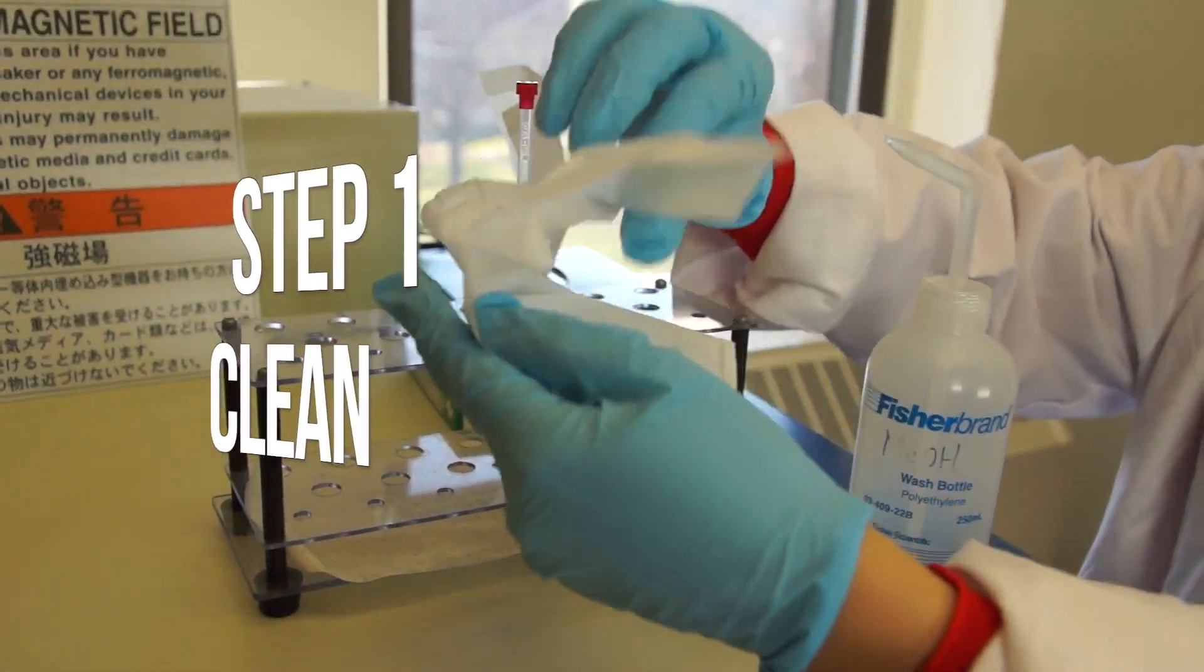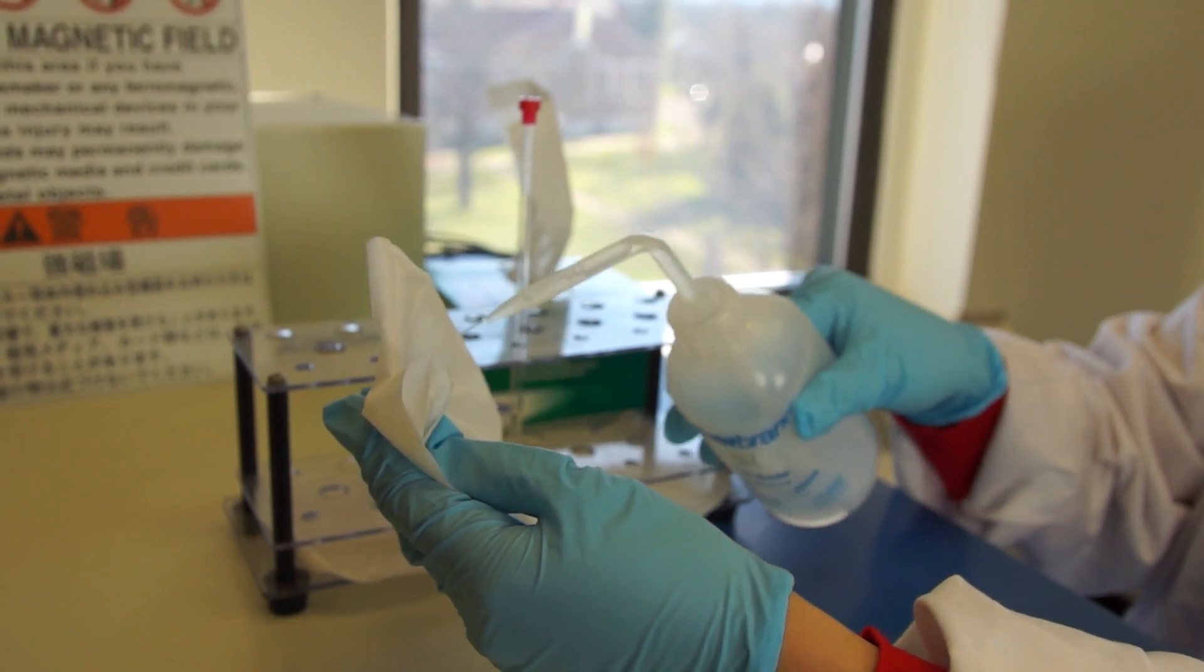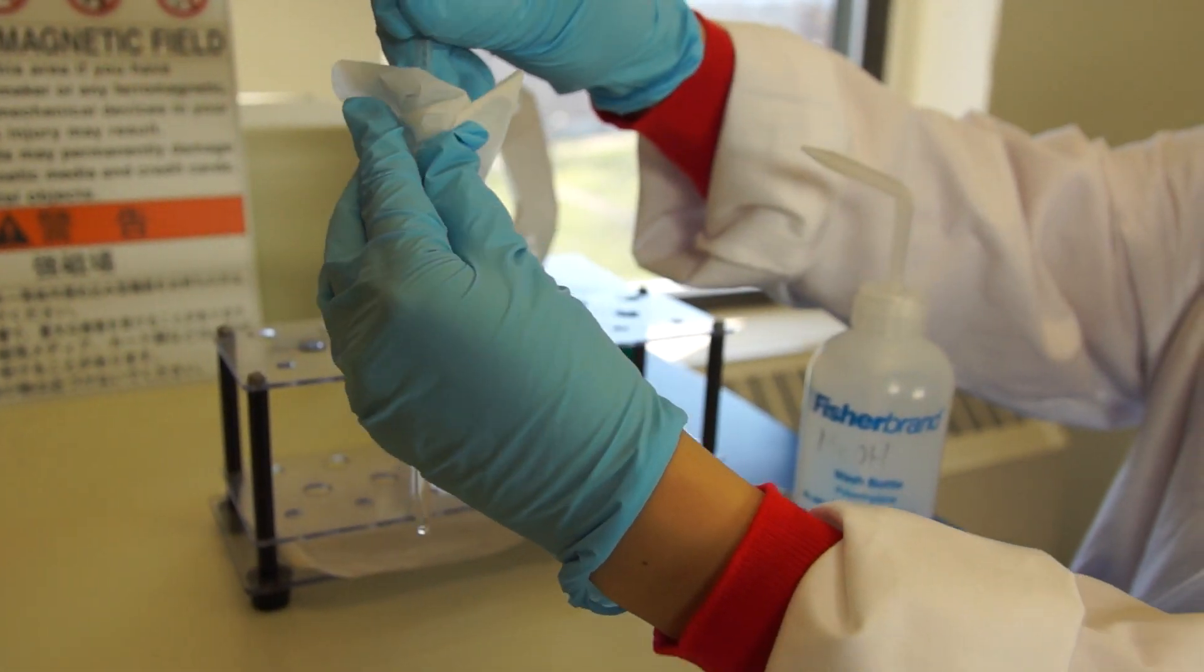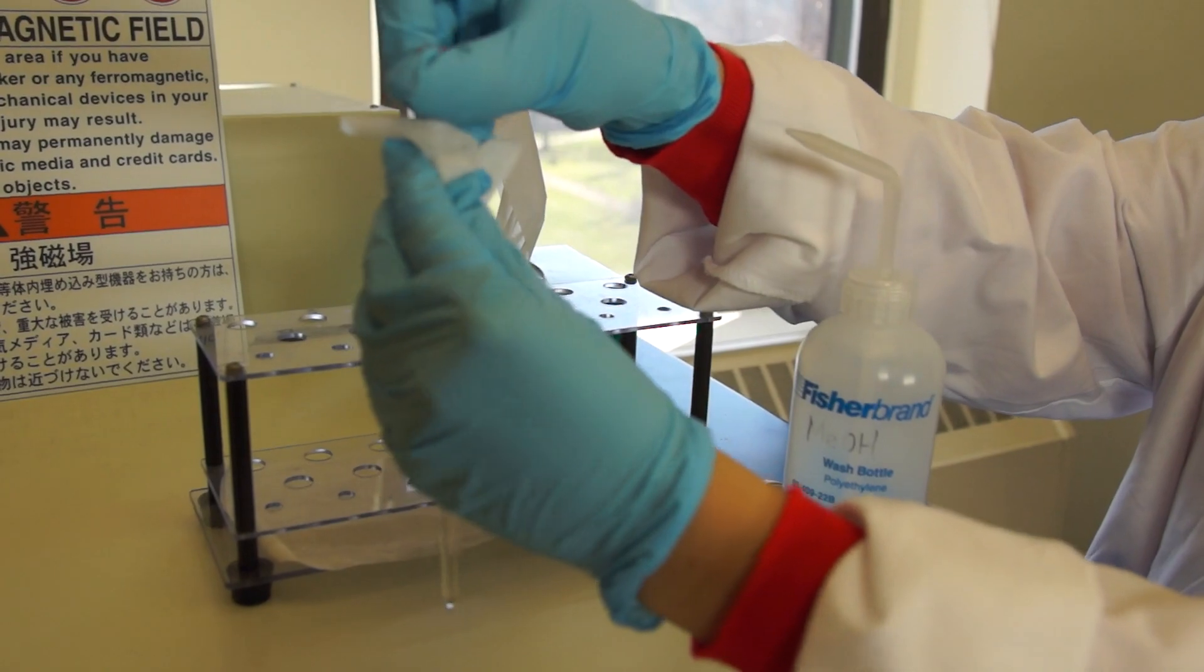The first step is to clean your NMR sample. Spray some methanol onto a kim wipe, just a couple drops, and then wipe the NMR tube with the methanol.